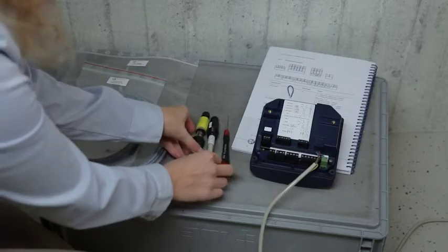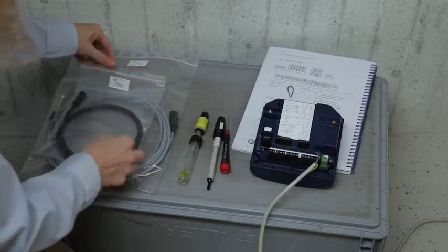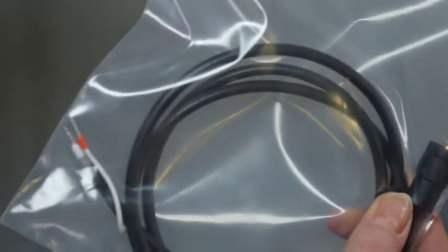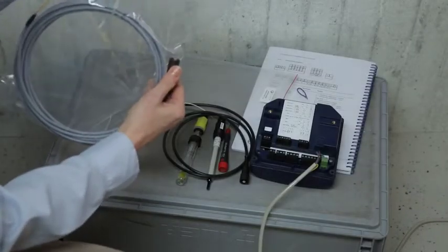You need two cables: a coax cable for the pH sensor and a 2-core cable for the temperature sensor.